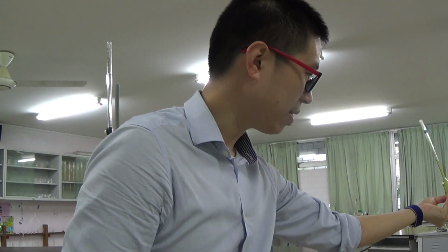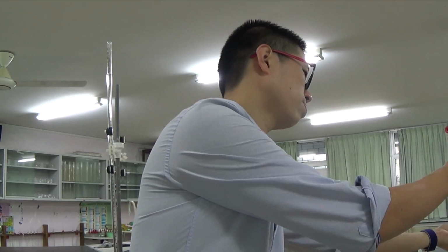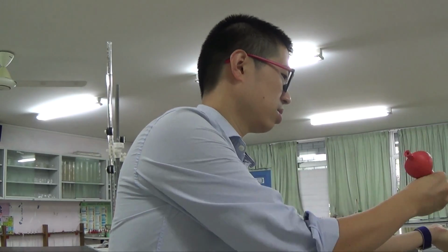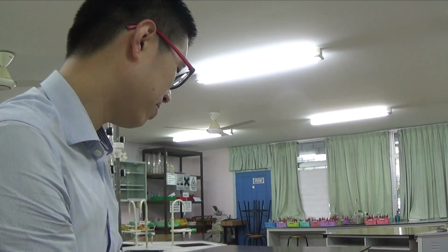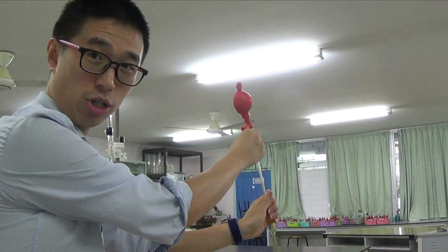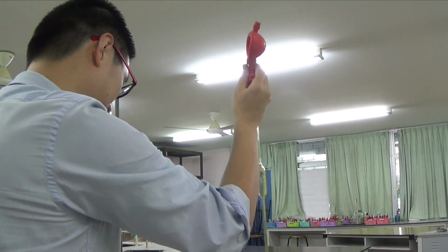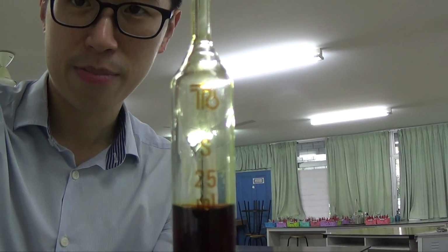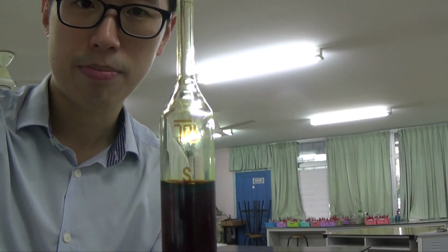With a little bit of it left in the pipette, it's alright, because we're going to do a pipette suction anyway. I think the problem is the brown solution is really staining. I don't want it to stain my shirt at all. I should really be careful with this. So I'm ready to suck out 25 cm cube. This is a 25 mL, 25 cm cube. It's quite brown in color.